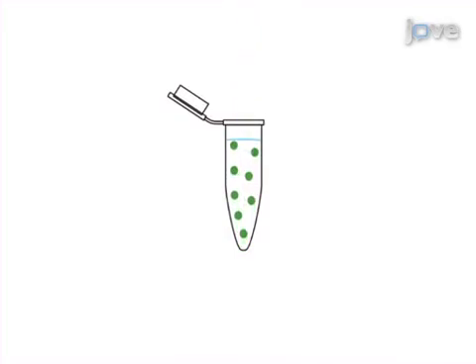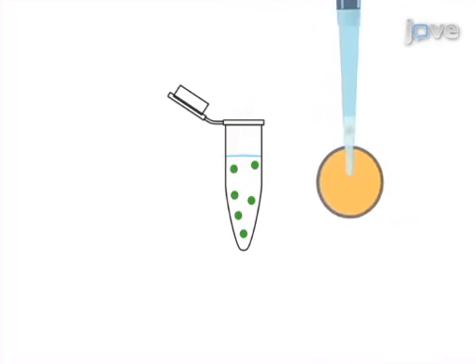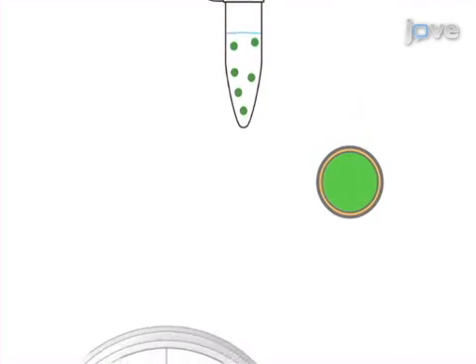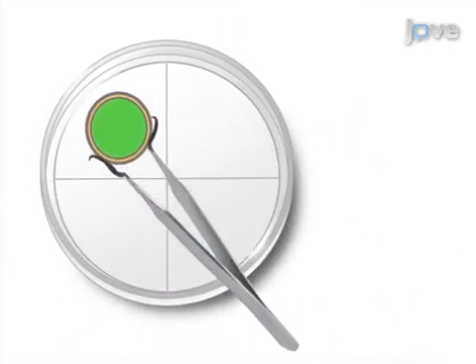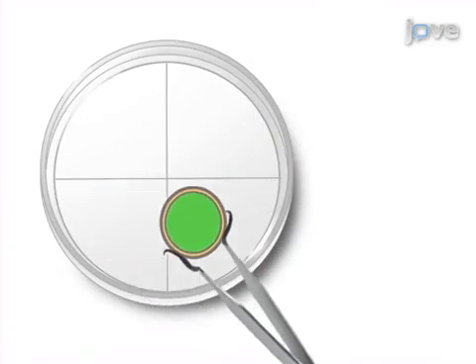The second step is to apply the protein sample to a freshly cleaved and clean mica surface for about 30 seconds. Then, the mica is rinsed with buffer to remove unbound and loosely attached molecules.